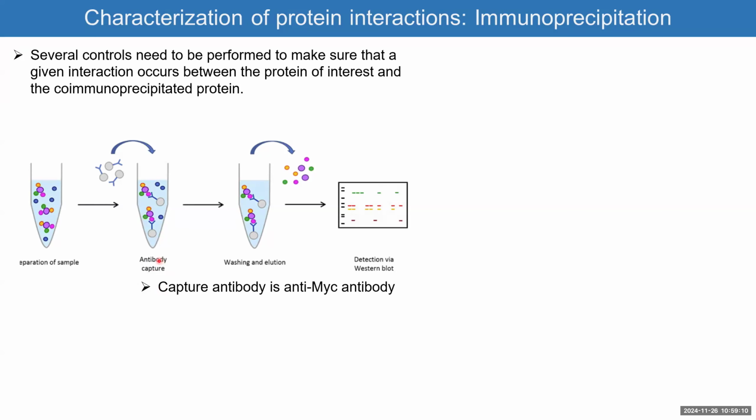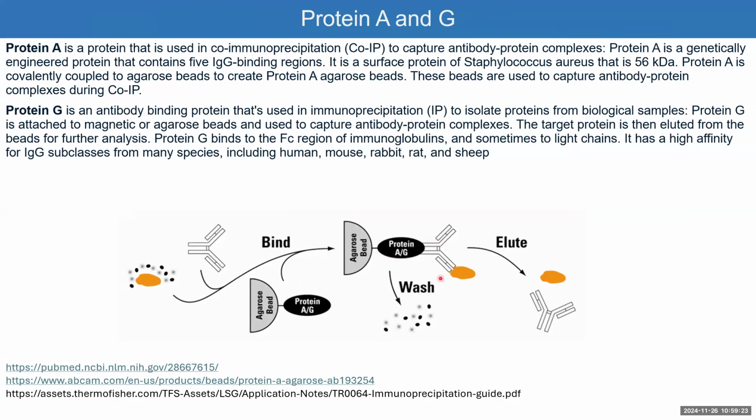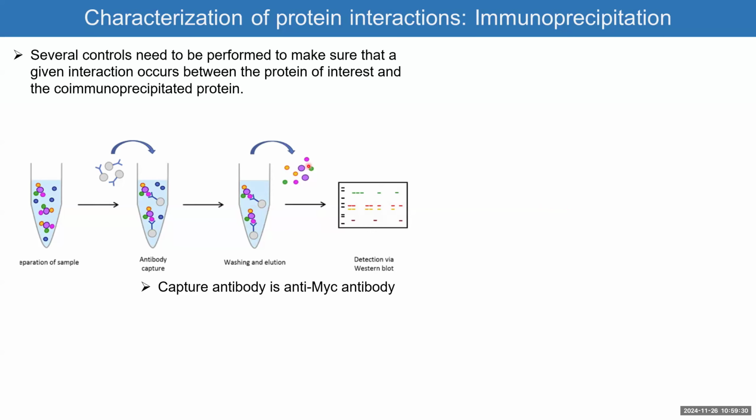So that's the antibody capturing step. Then the next step is when my antibody has to be bound to the beads. It's not shown there, it's here. So your antibody and the complexes are bound to the beads. And then the third step is to do the elution.